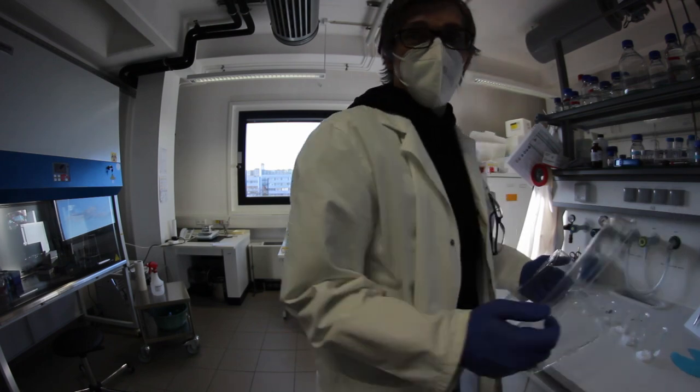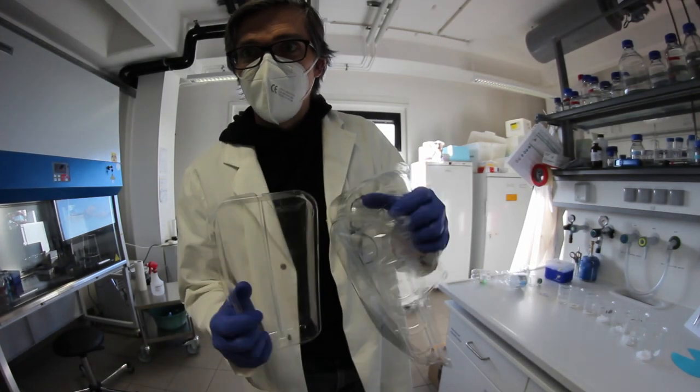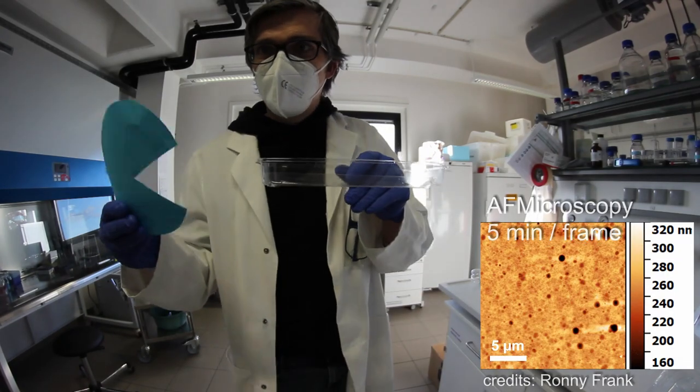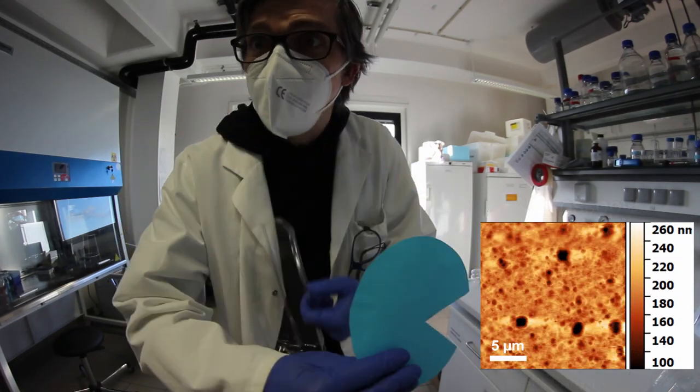On the one hand we have thermoform packaging PET like that one and this is super hydrolyzable by the enzyme. So we need less than one day to completely hydrolyze it. Perfect.